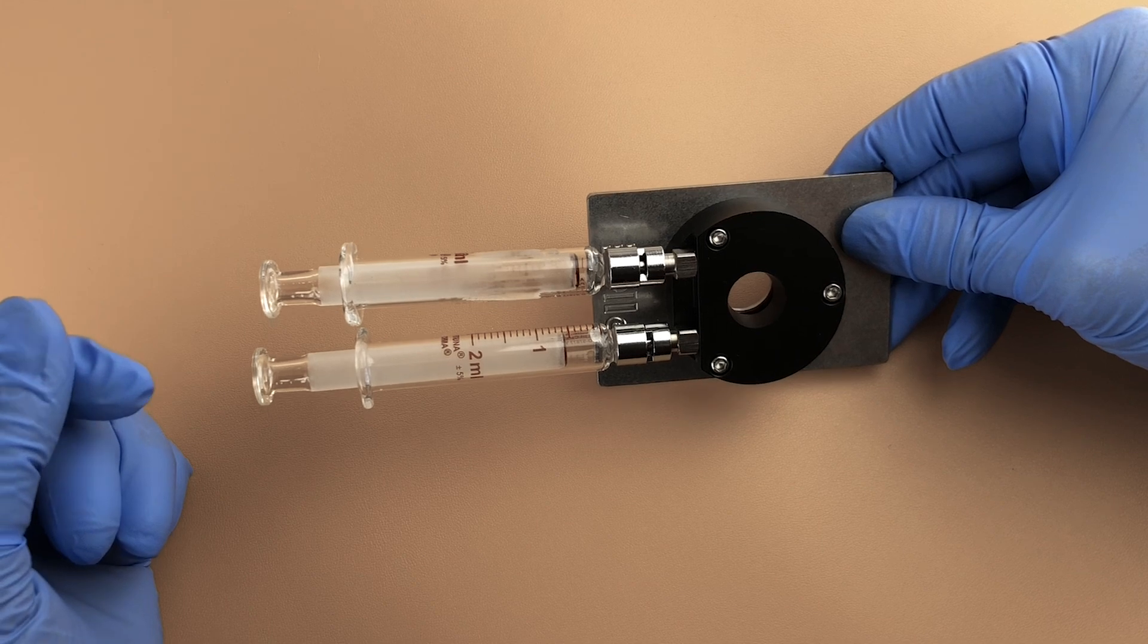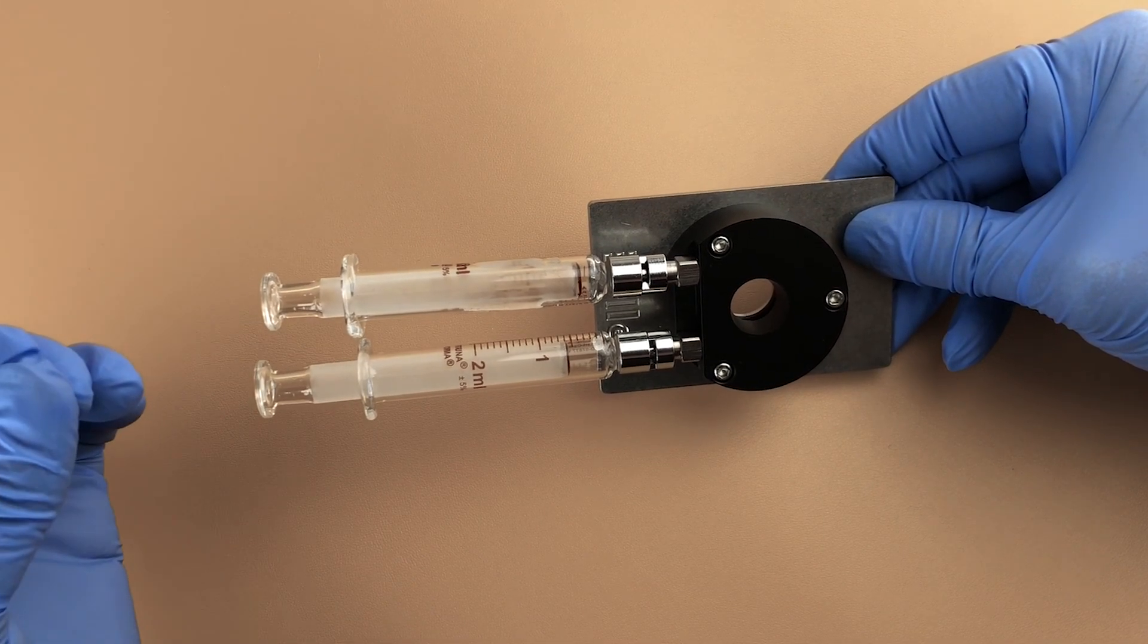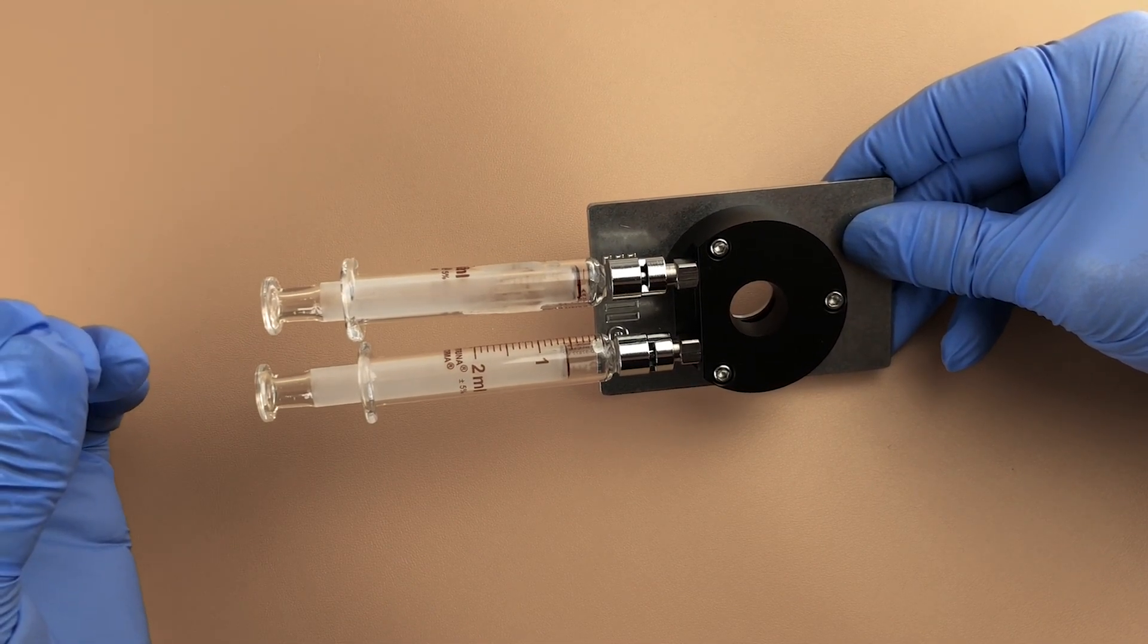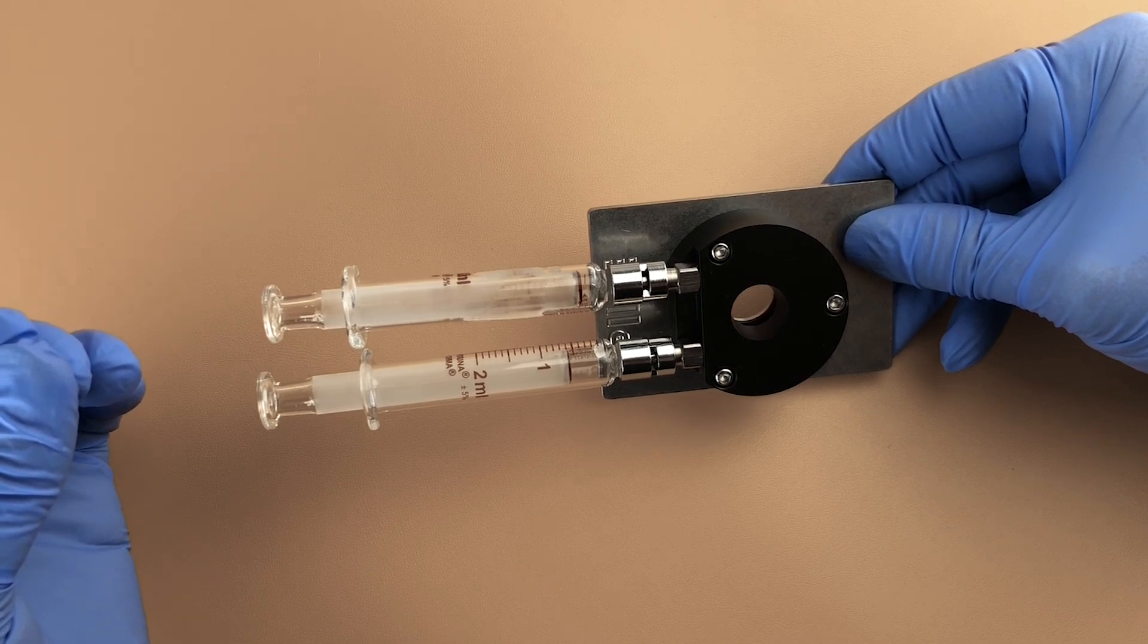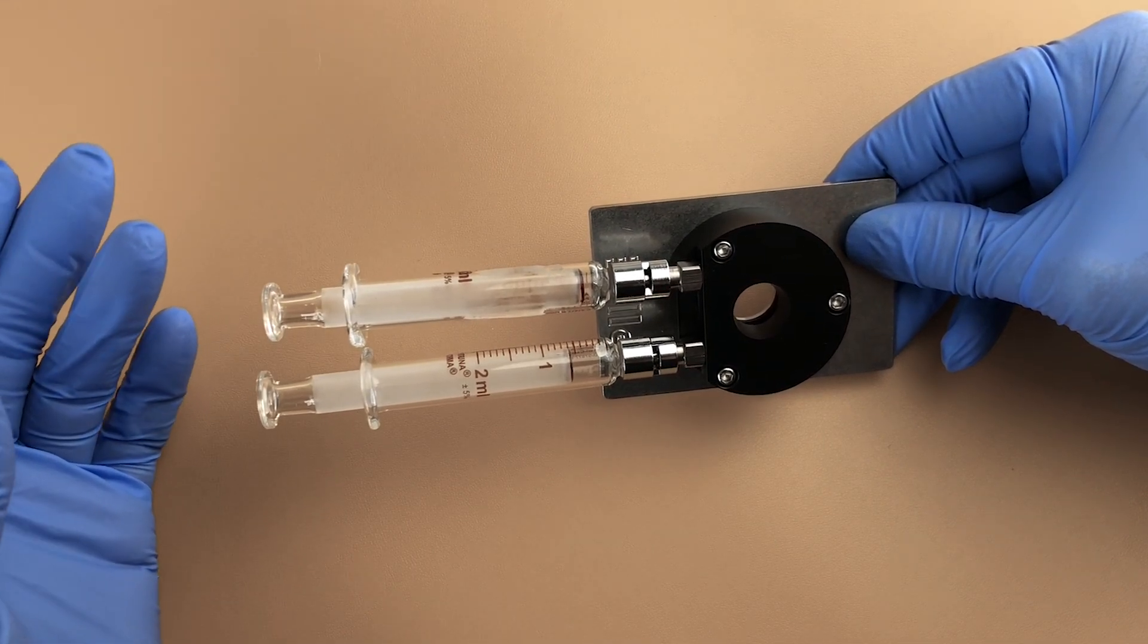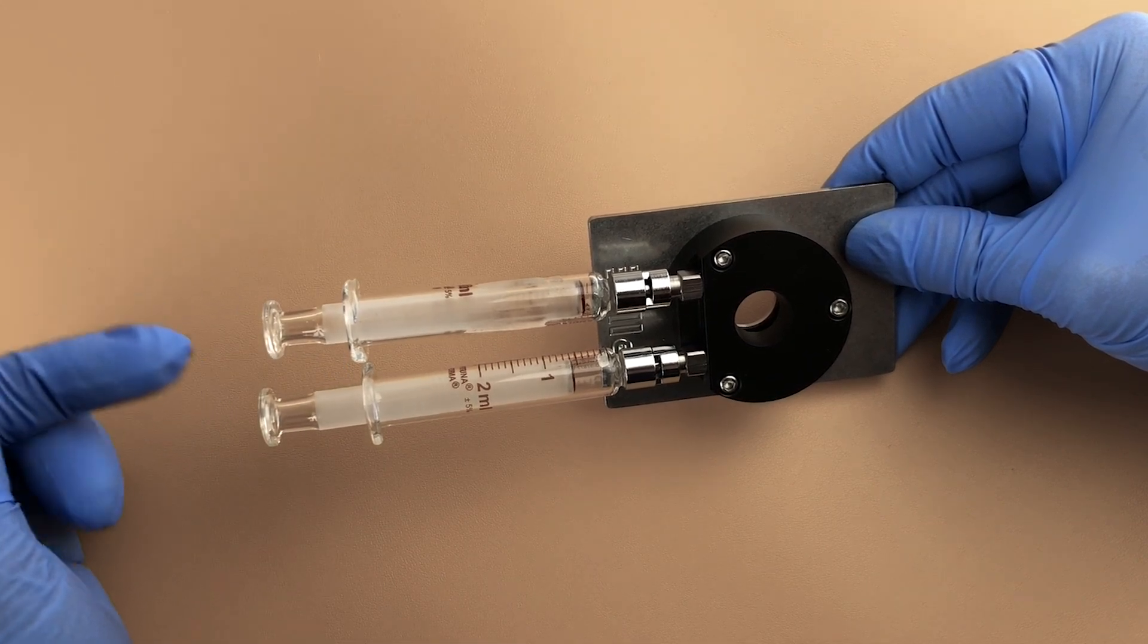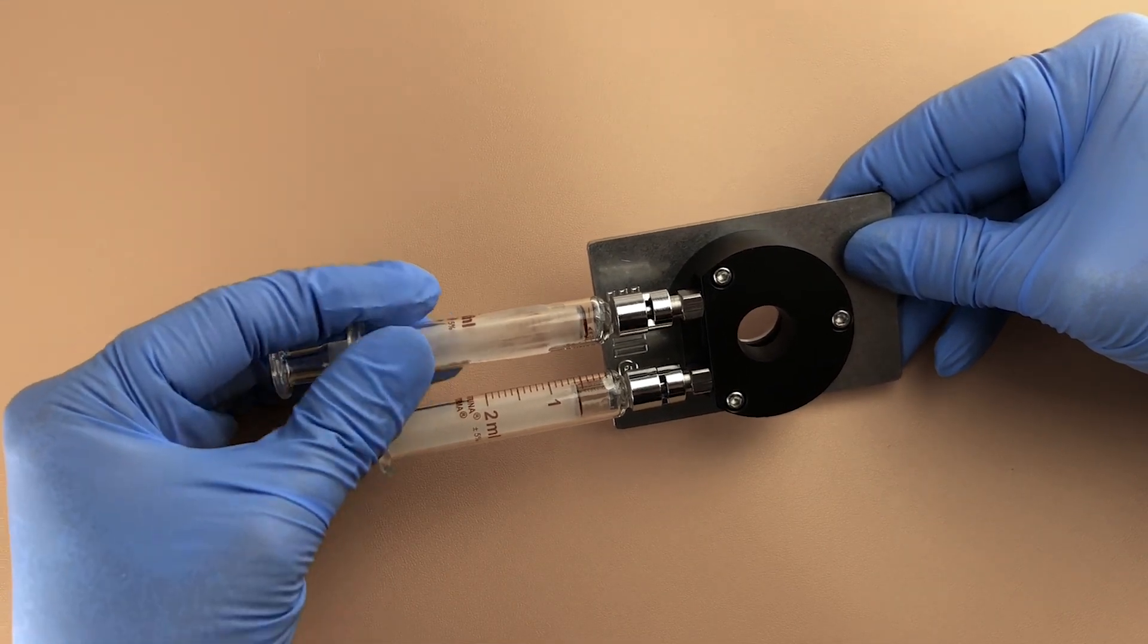Now if I'm using a very small path length cell like I did recently, it was a 25 micron cell and the sample was thick. Instead of using two 2 milliliter syringes, I used one 2 milliliter syringe and my empty syringe was a 5 milliliter syringe.